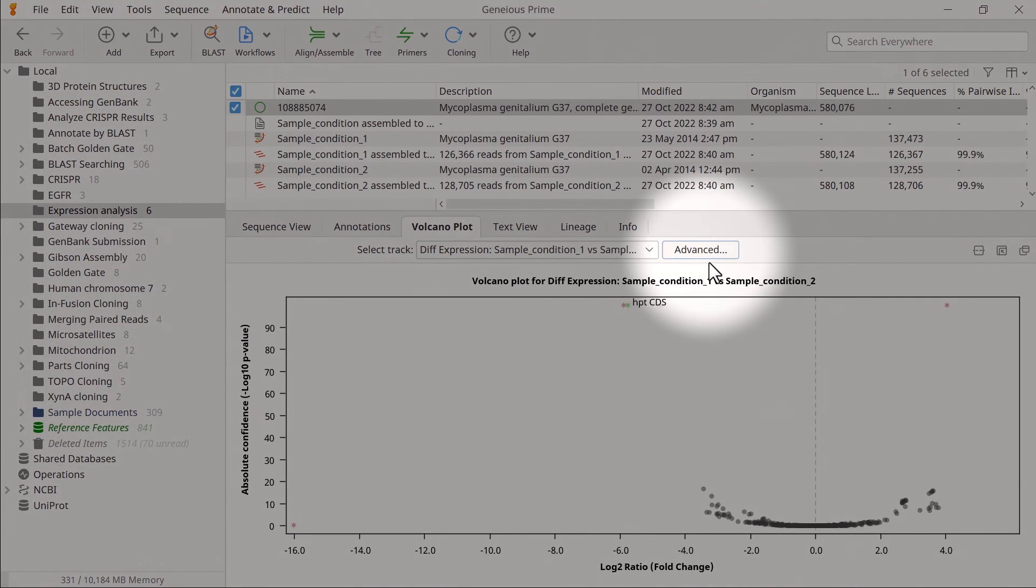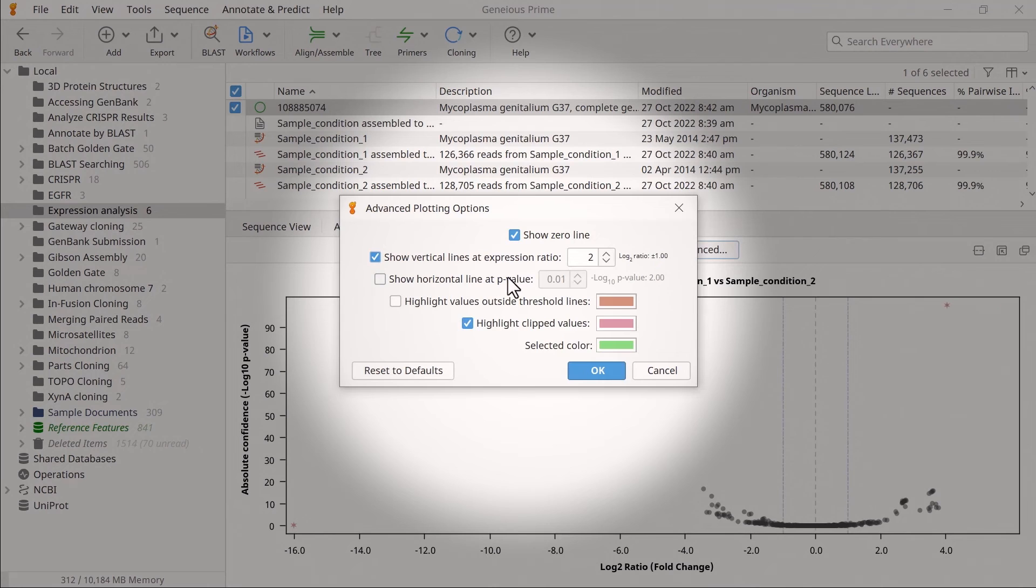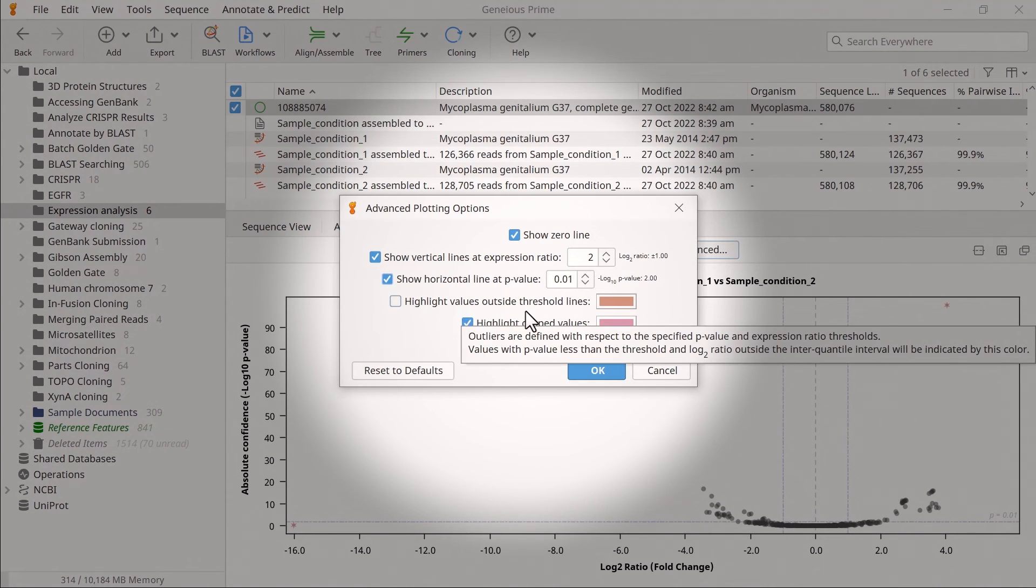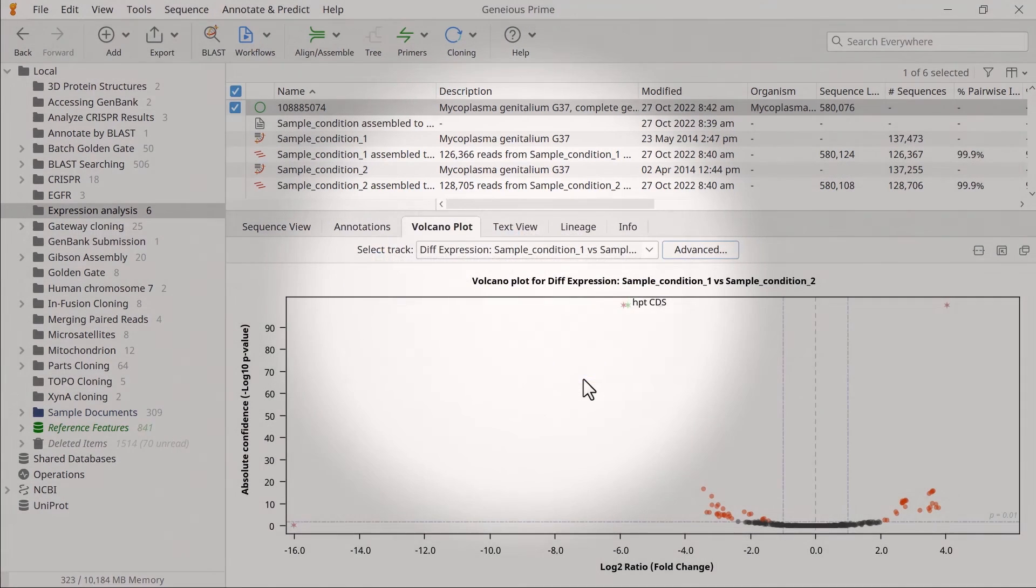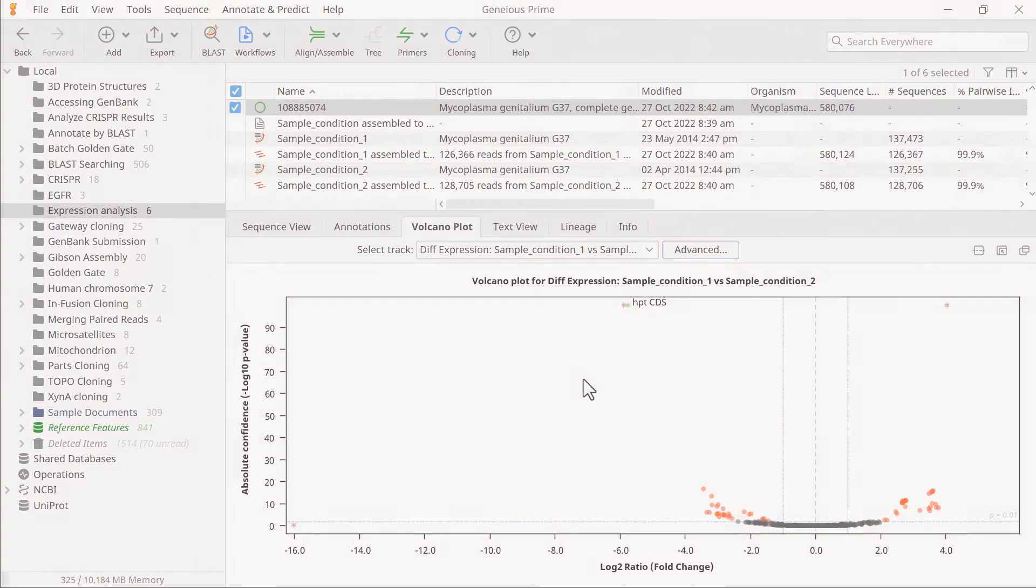By selecting the advanced option, you can also show vertical and horizontal lines at your desired level, and even color points that are beyond these thresholds. And that's how you measure differential expression in Genius Prime.